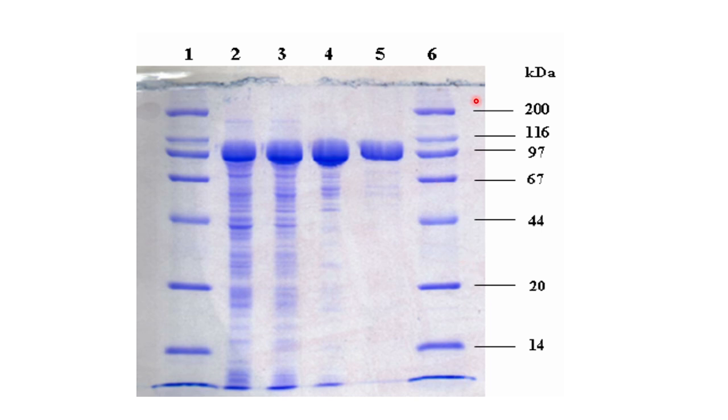Now you know that these molecular weight markers running over here are of an exact size, because this is a molecular weight marker and it's of a known size. So you take the logarithm of this molecular weight and plot it, with the logarithm of molecular weight on the y-axis and the distance on the x-axis.